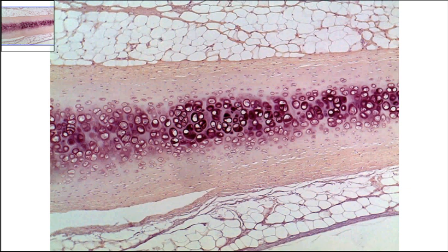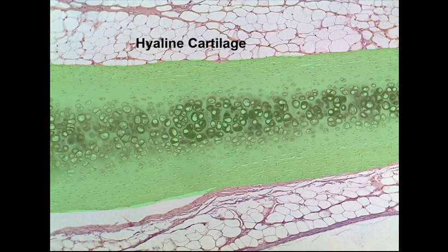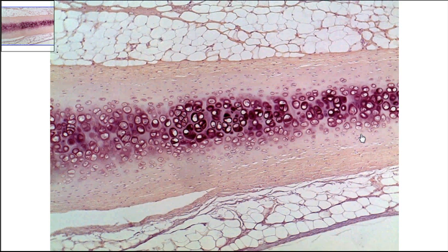This slide is hyaline cartilage, found in the middle of the slide right here. Above and below is adipose tissue. The current magnification we're looking at is 100x total magnification.